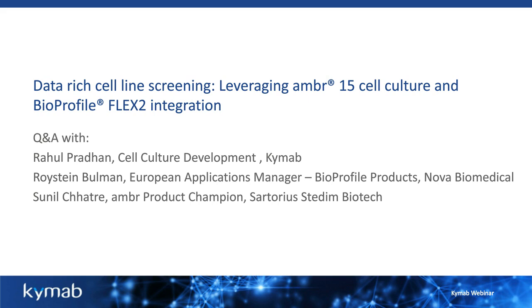Thank you very much. So we have one more question that's come into the inbox, regarding the ambr250. Is it possible to integrate the ambr250? Yes, it is. Yes, you can integrate all the different types of analyzers. The ViCell, the CEDEX, the pH analysis module, and the Nova Flex can all be integrated in any combination that you want on an ambr15 cell culture or onto an ambr250 HT.